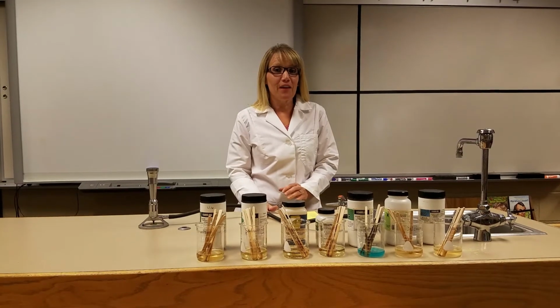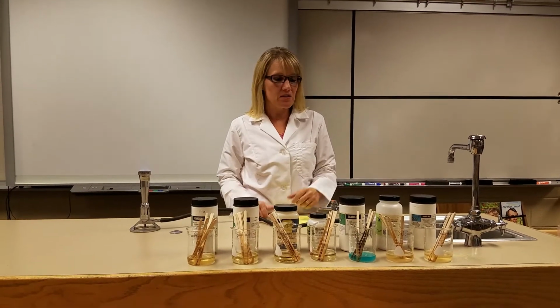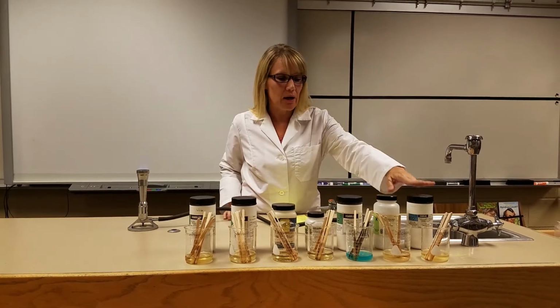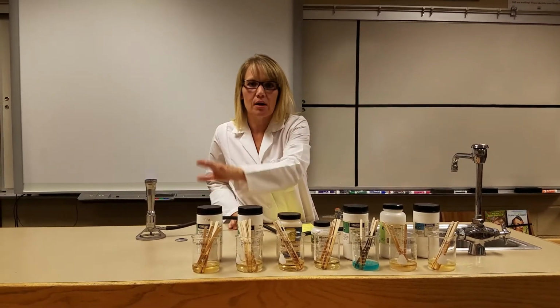All right, I'm going to do a flame test demonstration for you today. If you can see on the counter here, I have 7 different compounds. These are all different salts, so it's some element mixed with chlorine to make a salt. So we have barium chloride, calcium chloride, cupric chloride, lithium chloride, potassium chloride, sodium chloride, and strontium chloride.